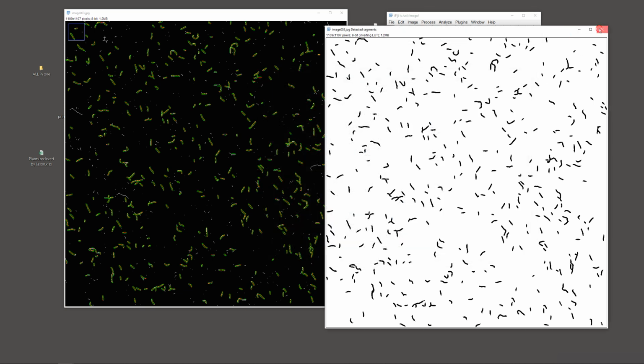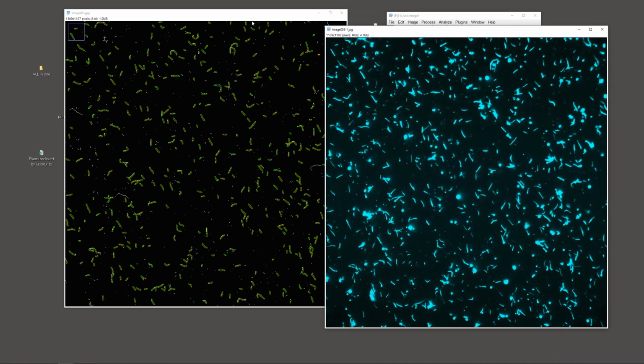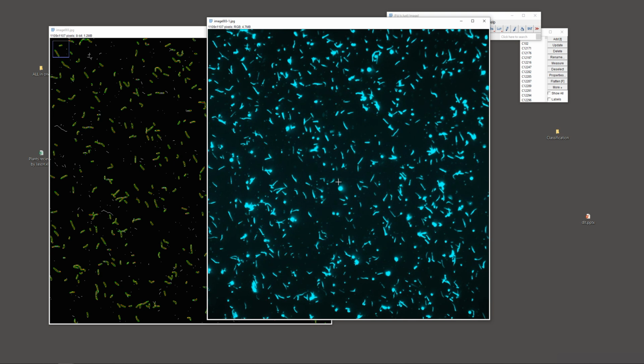So I'm going to close this and open the image. This is the original image. And if you put, for example, this and this class, you will be able to track, for example, all of these ones. So this can be a good option and a faster one, and also a little bit more precise because, for example, you have removed all the round objects. Anyway, whichever method suits you better will be okay.